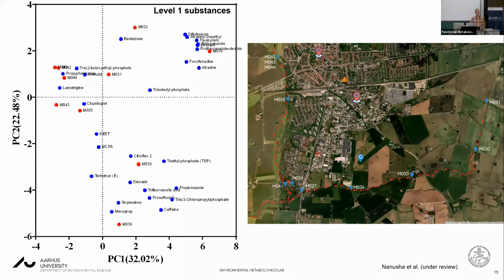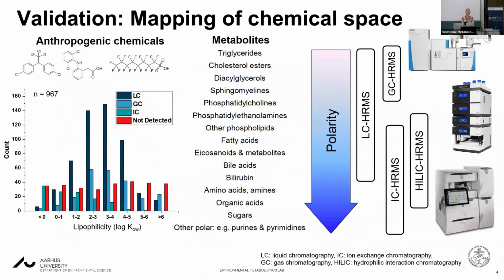Different MS to cover the whole chemical space, but how about the sample treatment? For these different compounds, loss and recovery during pre-treatment can also vary. I assume you may use solid phase extraction to concentrate the sample. Yes, and I think even a different column can also lead to a different recovery of a range of different compounds. Yeah, it's a very good point, how we do sample prep and how we are sure that we can capture everything.